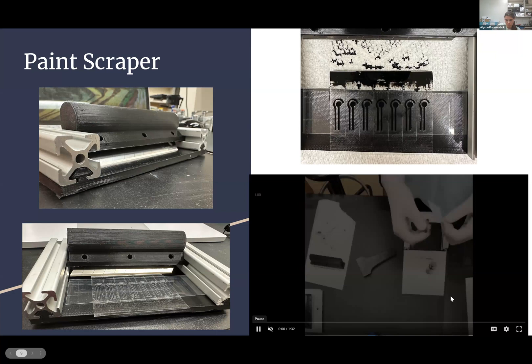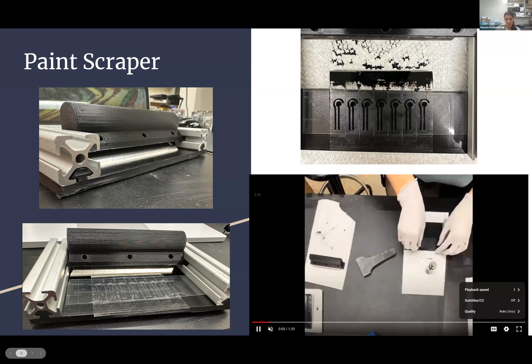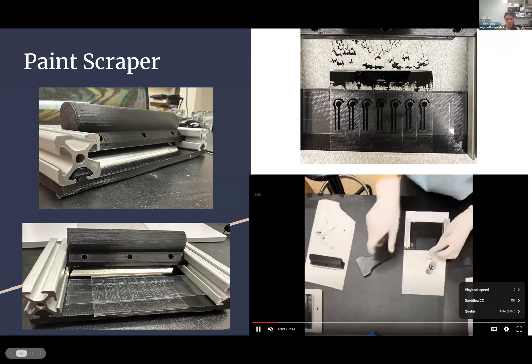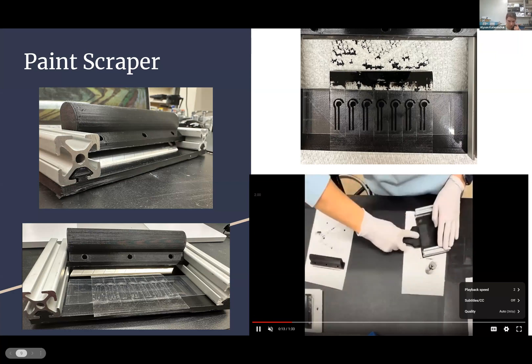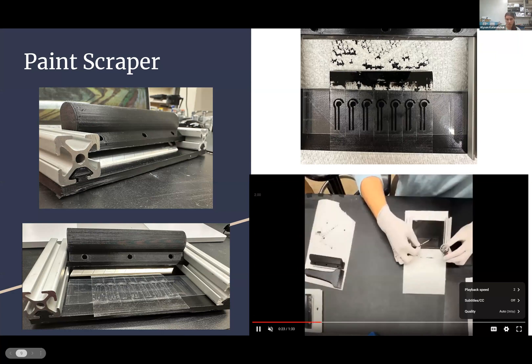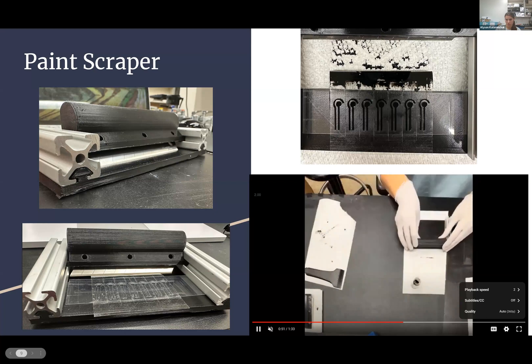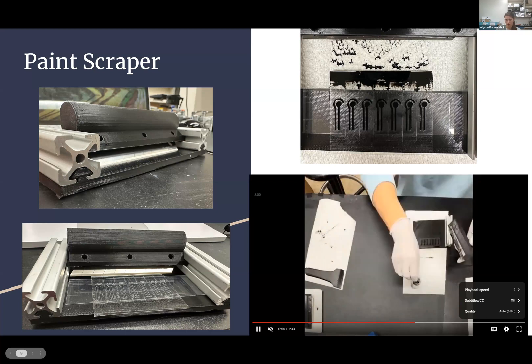For applying the ink, I used a simple X-Acto knife as a scraper over the stencil. To get a more even application, I designed a paint-scraper vise using 3D-printed parts and a railing so it would apply a very firm, consistent pass onto the sticker. The video shows the process: with the sticker already on the PET, I scrape the ink down firmly — you have to press it close, otherwise ink seeps under the sticker. I used a toothpick initially, then switched to a paint-like scoop for easier ink application, scraping through around two times to get an even surface.